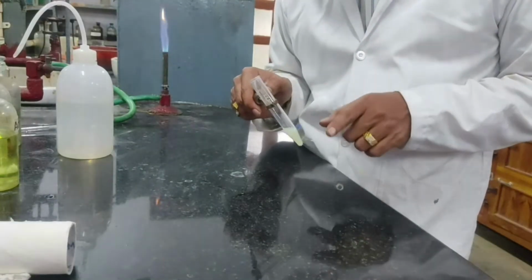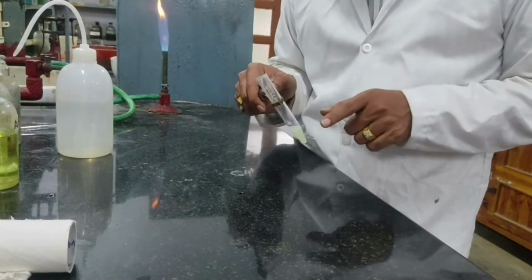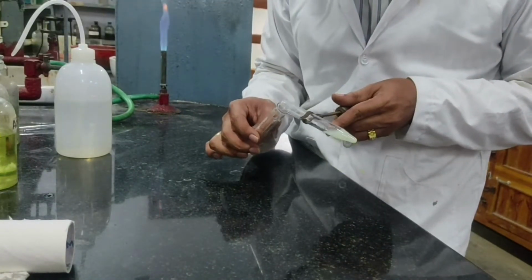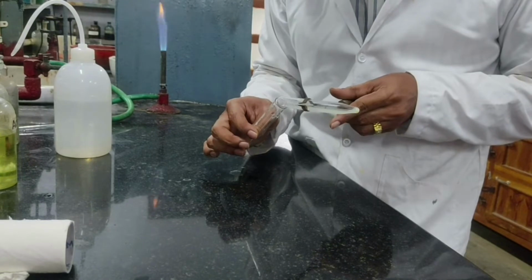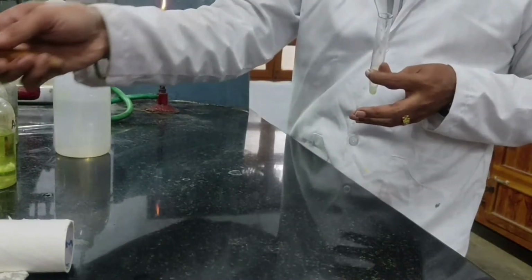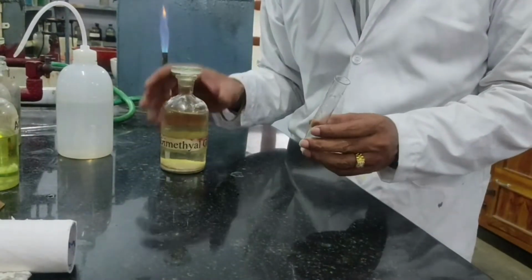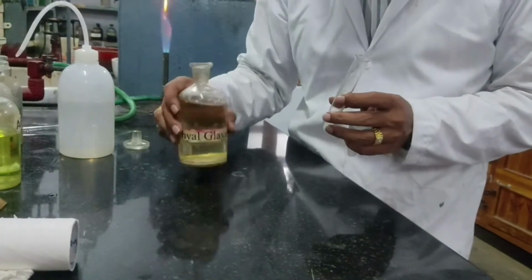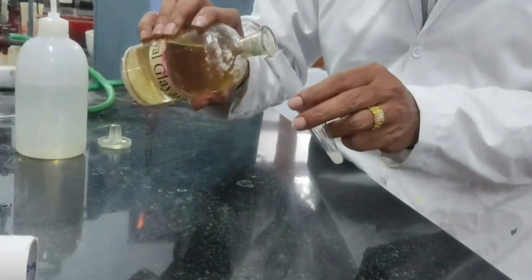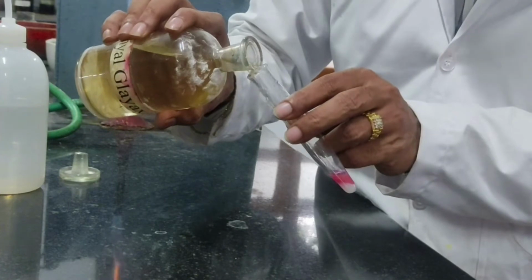I am going to do a test for Ni+2 using DMG, dimethylglyoxime. I take a small quantity of this solution into another test tube and add a few drops of dimethylglyoxime. Carefully observe. We must get a scarlet red colored precipitate.